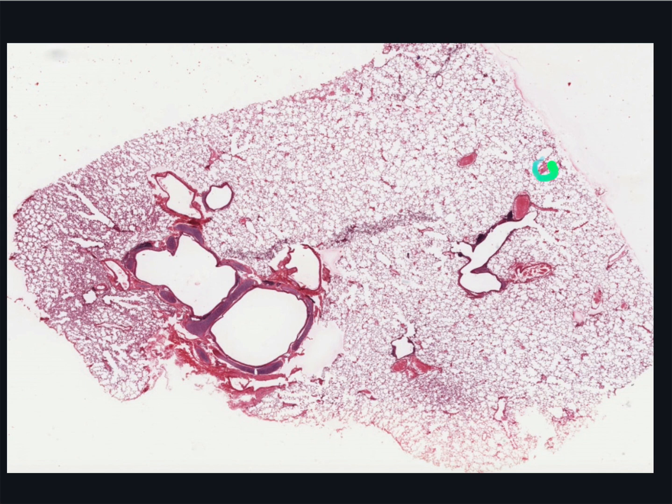But before we revisit this section of lung tissue at a higher magnification, so I can verify why I identified these components as I just have, let us just understand the major histological features of this respiratory tree from first looking at a microanatomy model.